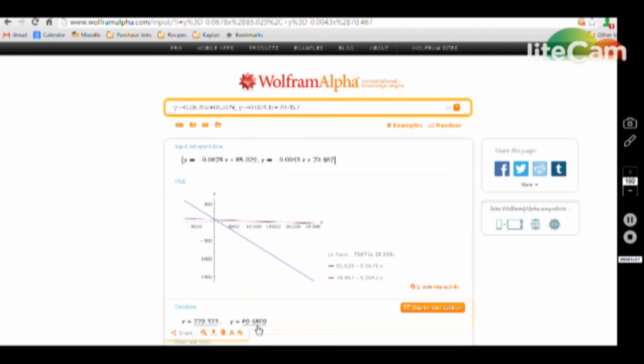Now that we've done all of the graphing and calculations for our stearic acid sample, you'll now go back and follow the exact same steps using your mixture data, creating a separate graph and doing a second intersection calculation to get a new melting point.